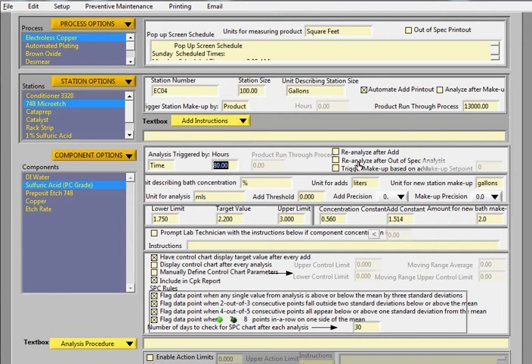If the analysis was out of spec, and you want to have the technician analyze again, you check this box, and then the trigger makeup based on the set point. Or rather, based on the add. So you can actually trigger a makeup if you really wanted to.